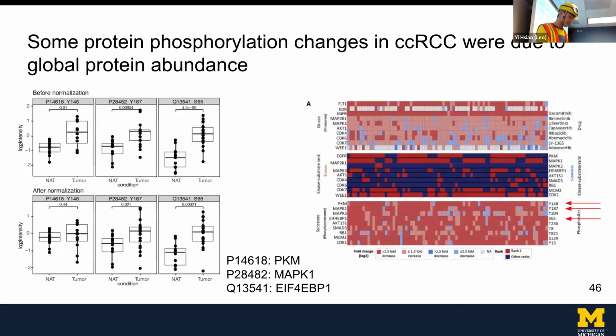And with similar functionality as I demonstrated earlier, but now you can do it in a script, you can pull out some protein markers previously proposed and see if they are really differentially expressed between the conditions.